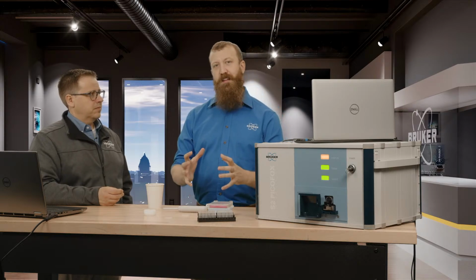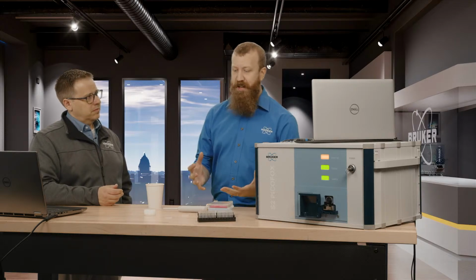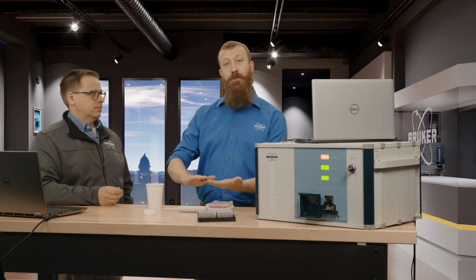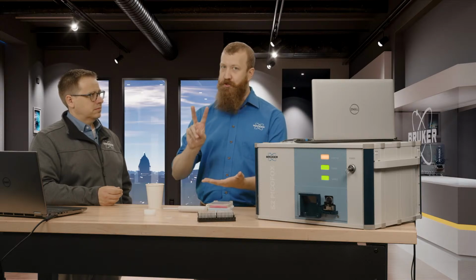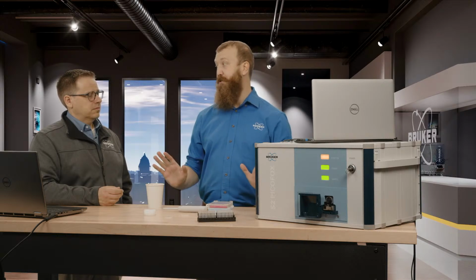But what if you could take that three-dimensional space and simplify it somehow? Like, for example, if you could take that lake and dry it until it becomes a two-dimensional surface. Well, now that it's two-dimensional, there is no more of that attenuation effect because we can treat it as if it were an infinitely thin film, and then all of those effects go away.